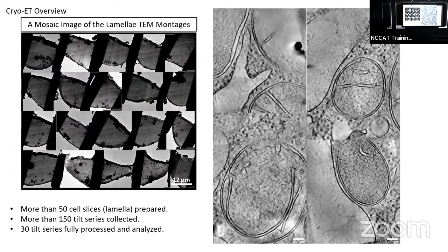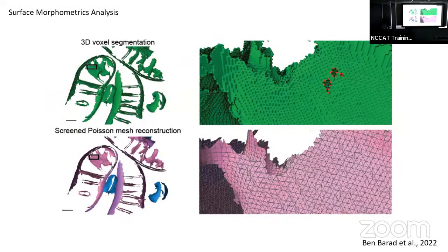And I had to do all of the analysis manually, like the subtomogram averaging and the segmentation. I didn't process the full overexpression data, but I processed it to a point where more data wouldn't make a difference. So we'll get to segmentation first.